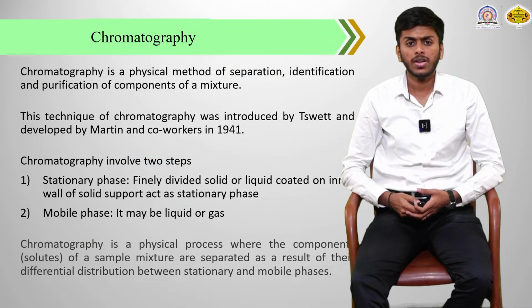So what is chromatography? Chromatography is an analytical tool used for separation, identification and purification of organic compounds of a mixture. This technique of chromatography was introduced by Tswett and developed by Martin and co-workers in 1941.